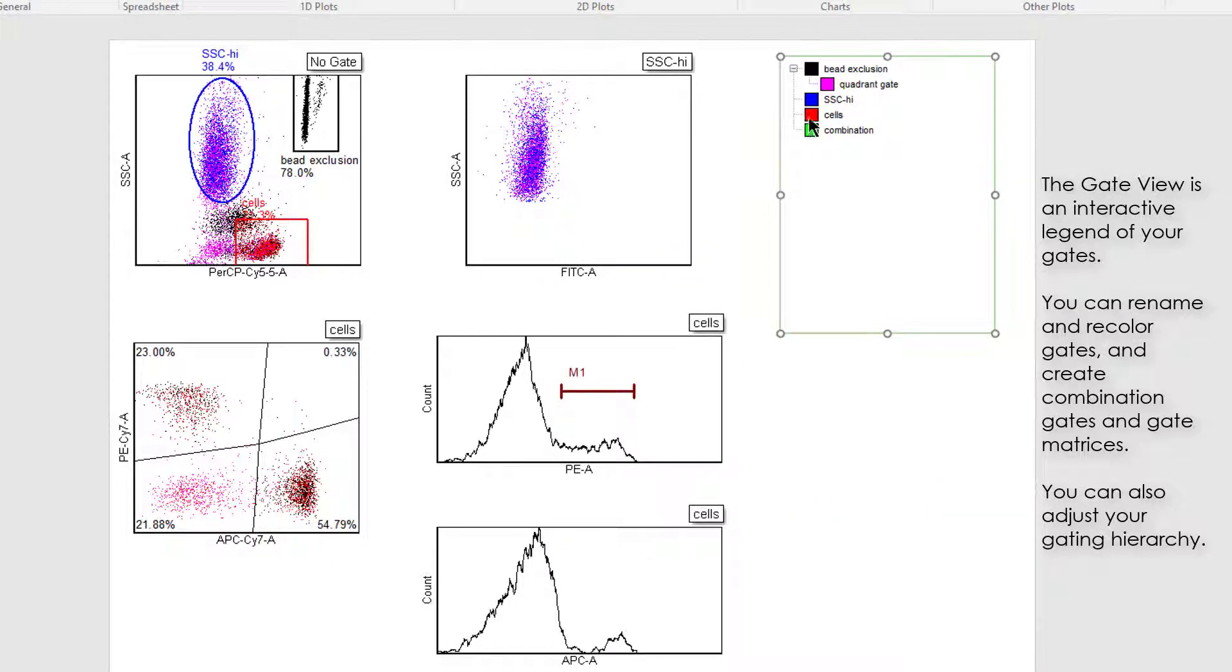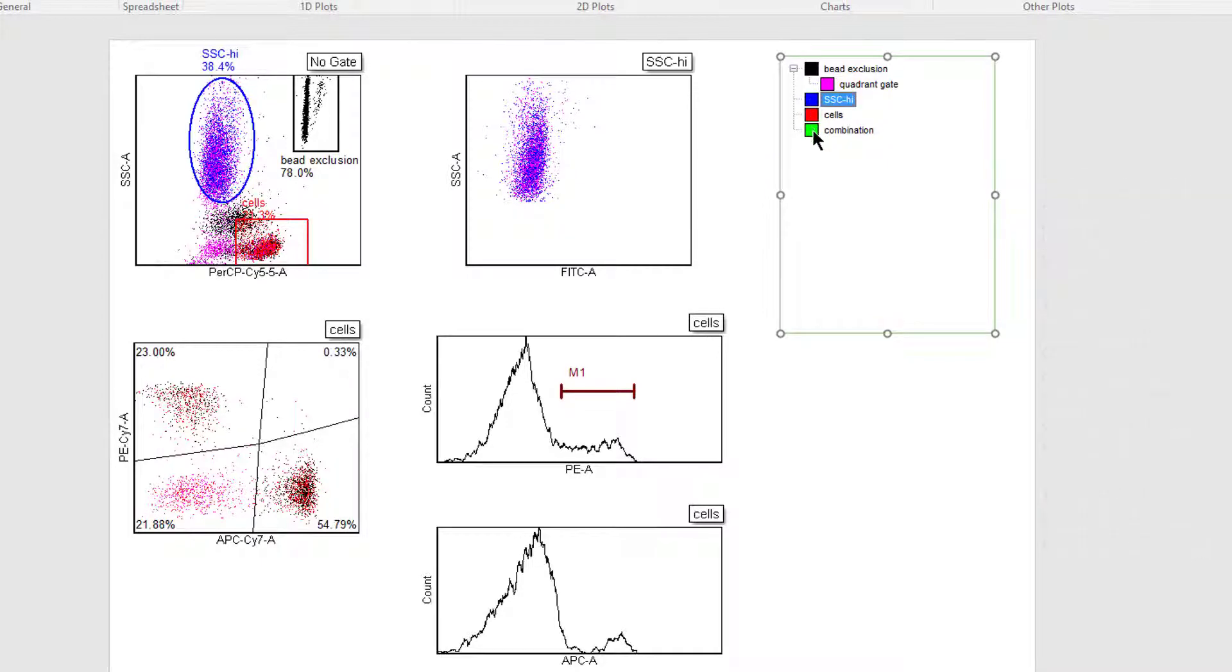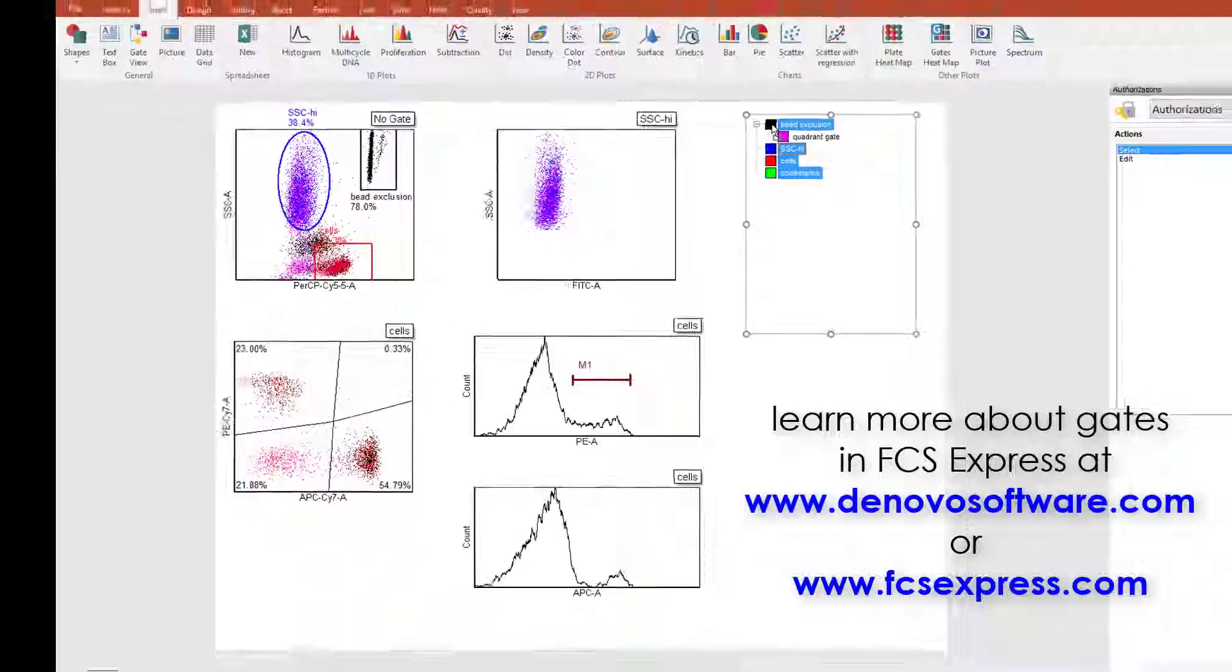In the GateView, you can also reorganize the hierarchy of your gates simply by selecting the gates and dragging and dropping them into the parental gate.